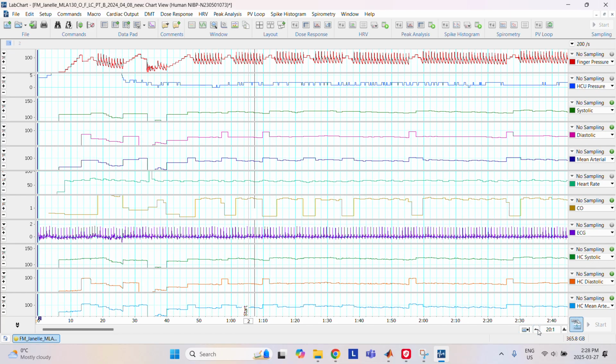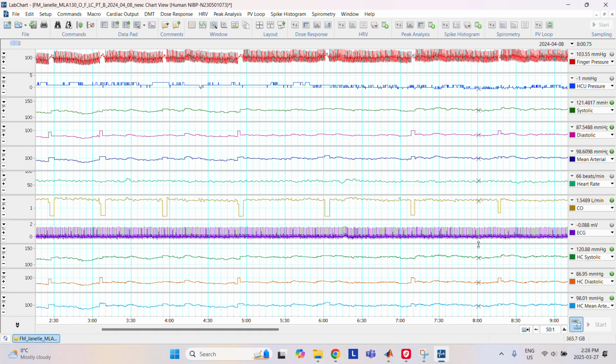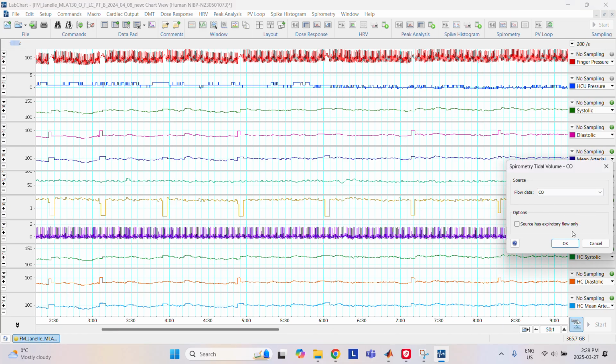I like to put this more to like maybe 20 and then see what the readings are and compare the two. So we're looking at the numbers on this end. With this model, during the parts where it's not calibrated, we can see 1.6, 1.6, 1.7, 1.7, 1.7. So it's fairly similar throughout. And then we can compare with the other one.